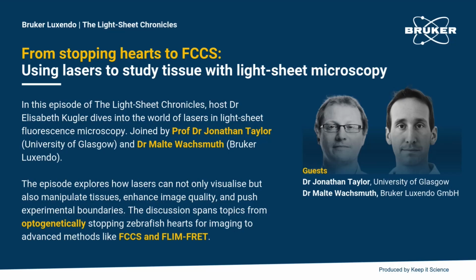But now to switch gears a little bit, on the other hand, to FCS and FCCS, there is a very different technique, which is FLIM, so fluorescence lifetime imaging. And Johnny, I know it is really becoming a technique that is very interesting to the community. So maybe you can talk with us a little bit in general. What is FLIM and why is it so interesting at the moment?